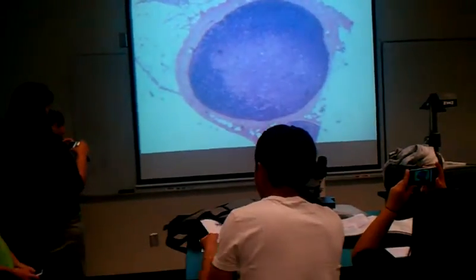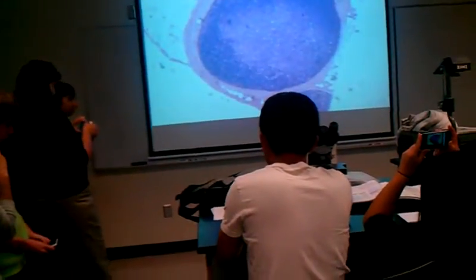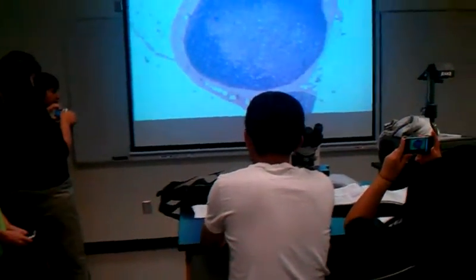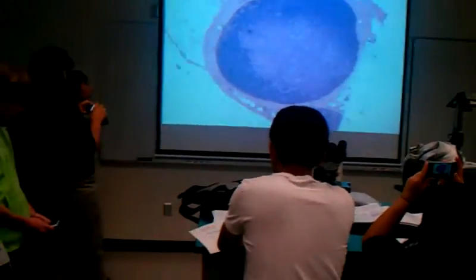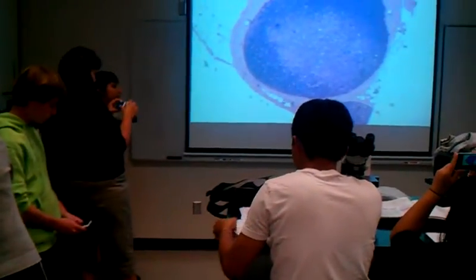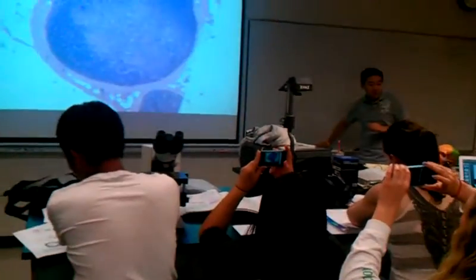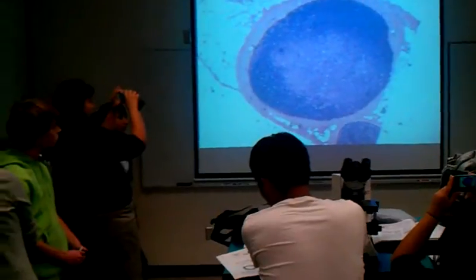Cross-section of a nerve, right? You guys understand how they're sectioning a nerve, what it means when we're saying cross-section of a nerve? You all understand this? So, if you can imagine, the nerve is like a tube, right?